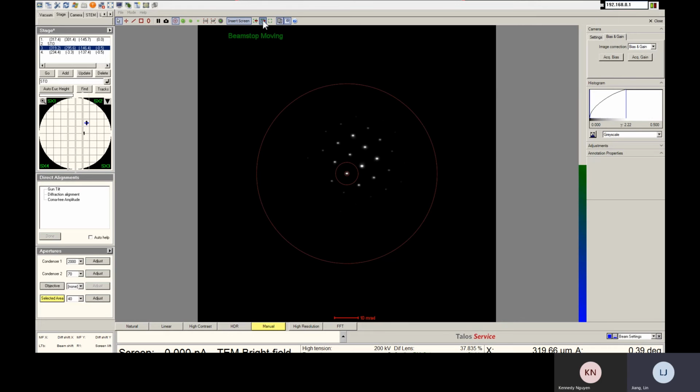Some spots are highlighted and some you cannot see, because of the sample location. Especially when you use a smaller select aperture, you will see more of this effect, because this is a small region, and then it's going to be more region dependent.